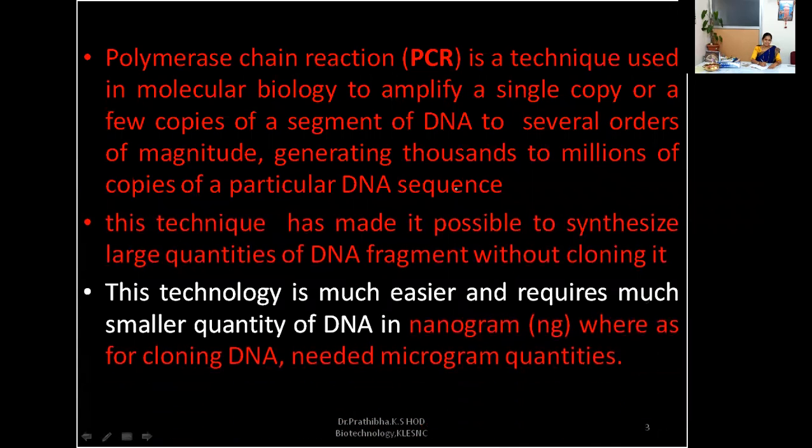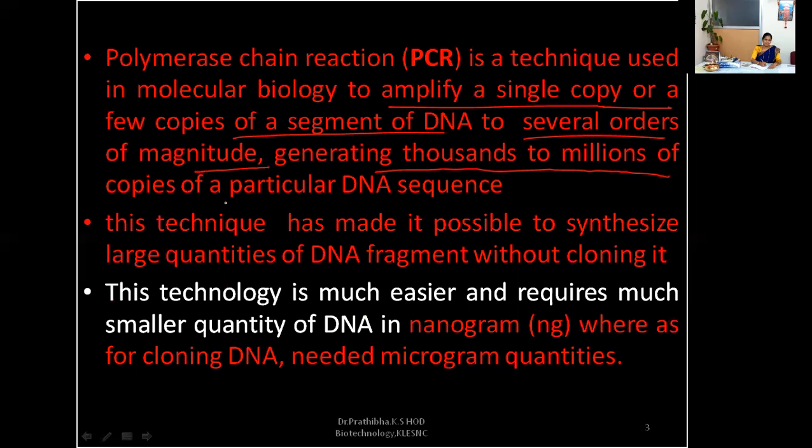Polymerase chain reaction is what kind of technique? A molecular biology technique used to amplify a single copy or a few copies of a segment of DNA across several orders of magnitude, generating thousands to millions of copies of a particular DNA sequence.